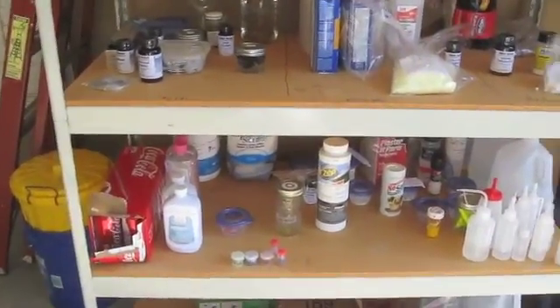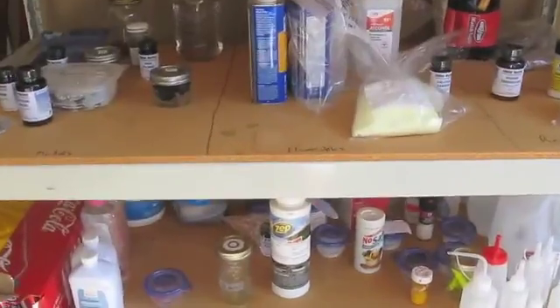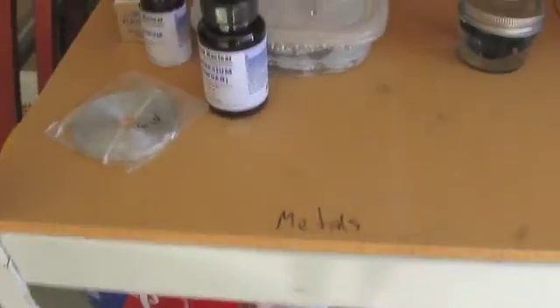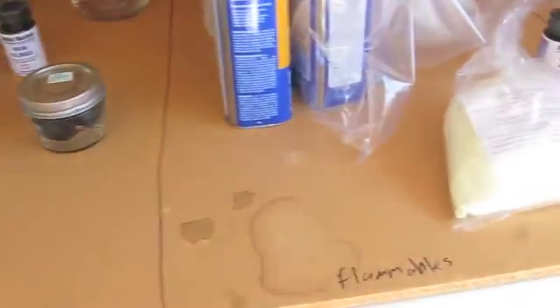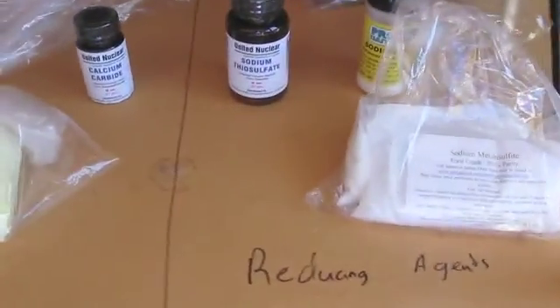I'm going to talk about all the different categories that I segregate my chemicals into and give you some ideas when you're storing your chemicals. Over here I have metals, and then next to them flammable substances, and then reducing agents.